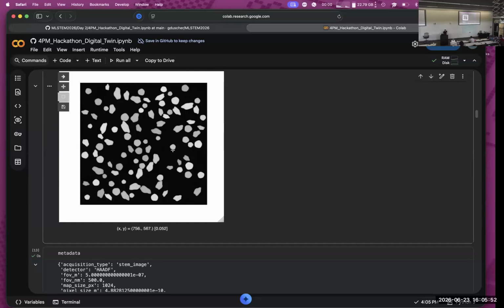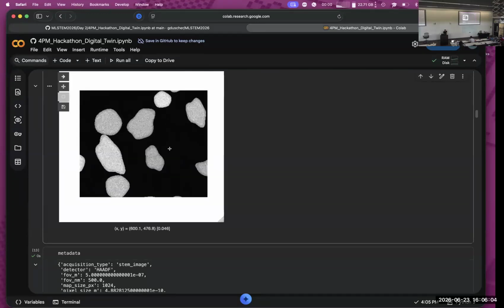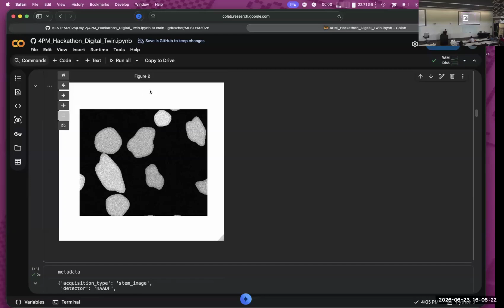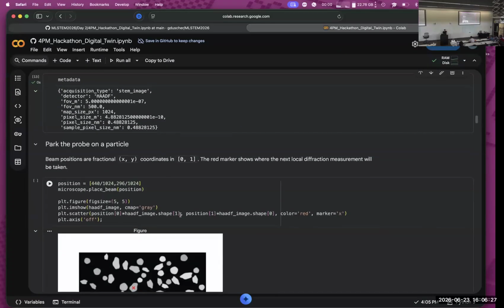And so just looking at the image, you'll notice one thing immediately. Well, a few things. There's different sizes. Some of them are more circular, and some are more ovular. And this is all just simulated, but I tried to build in many different patterns to see how much you can discover in an hour. And so I'll go ahead and give you a hint. The circular ones and the ovular ones have some differences in lattice parameter, a couple differences. And it's going to be your job to find it out.